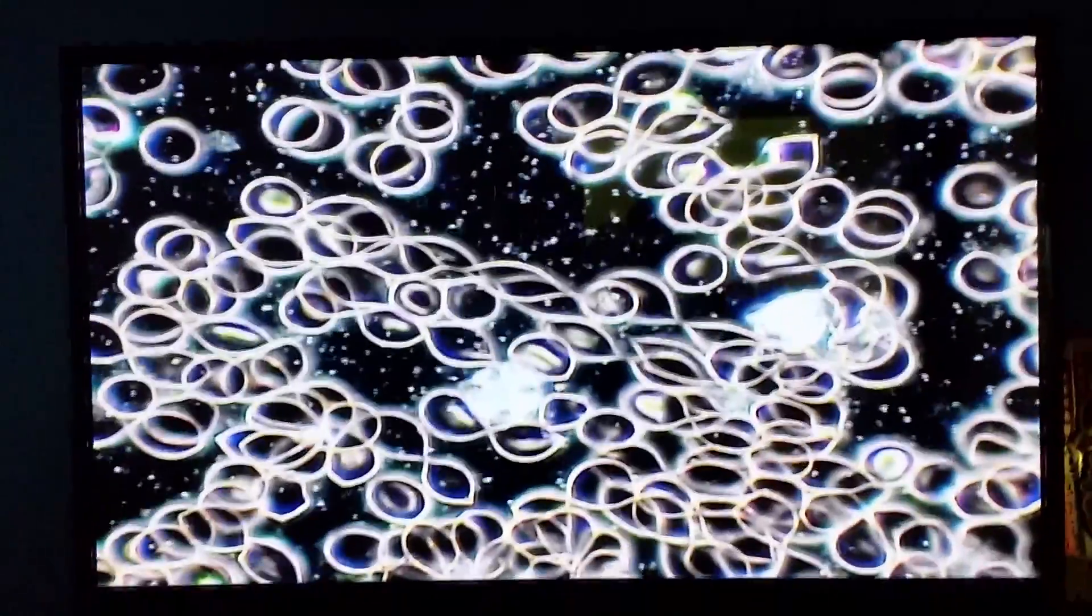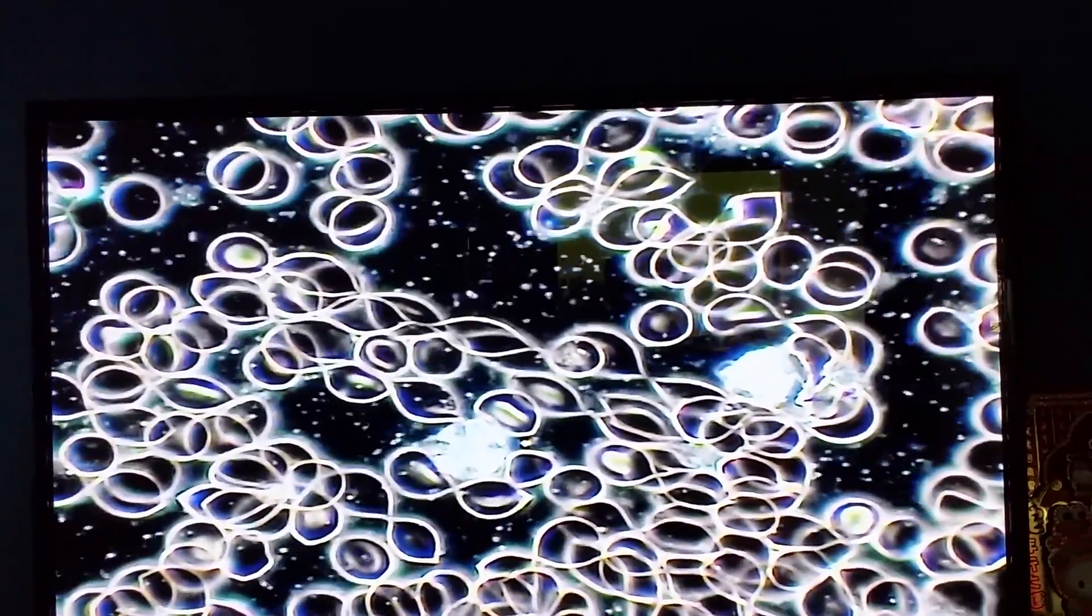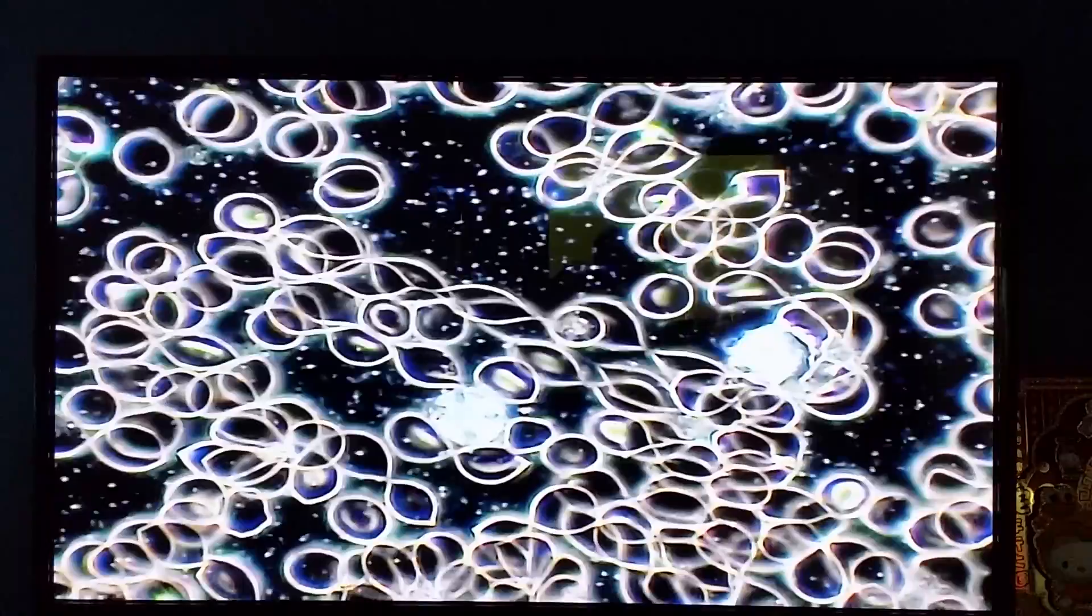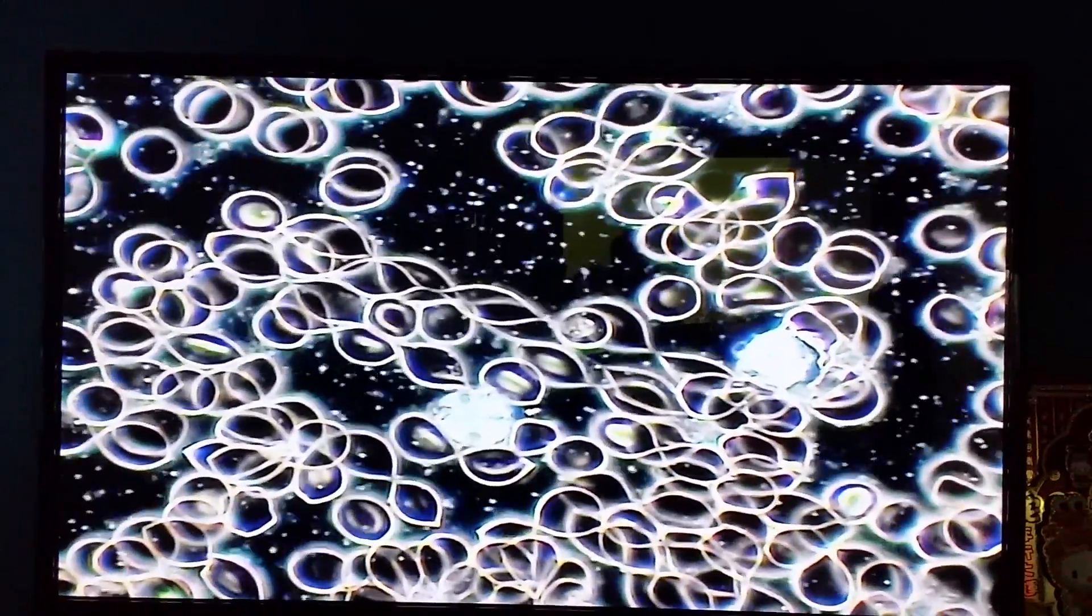In the dark field microscope, we can tell you there is an indication of allergy, but we don't know what you are allergic to. To confirm it, you have to do a blood test or a urine test to confirm which foods you're allergic to, or pollens, or chemicals.